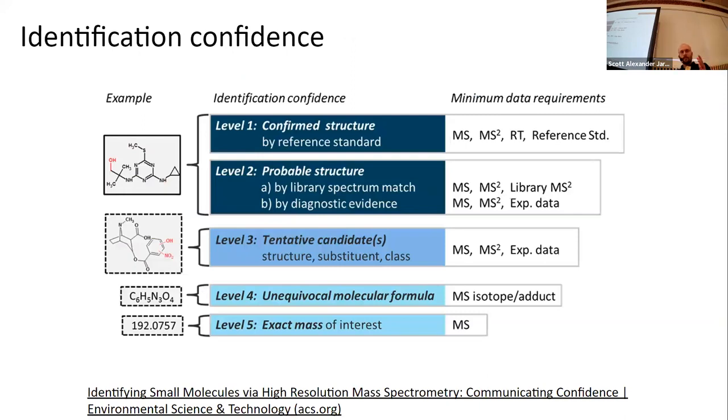And so when we're talking about annotation, there are these confidence levels that are vitally important. These are so-called Schymanski's rules, what I've learned them to be, but there are multiple different classifications of confidence level. There are some that only have 4 levels of confidence. I think the 5 levels of confidence is much more encompassing, but this is really, I would say, your gold standard for, in your paper, you say, this is the confidence level that I'm annotating my compound at.